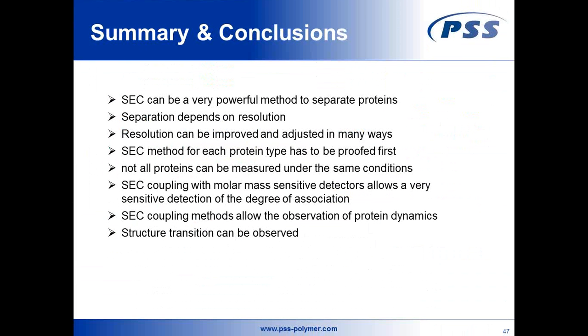So this brings me to the end, and I hope I could show you that SEC is a very powerful method to separate proteins. If you do it properly, you can measure protein aggregations, protein dimers, trimers, and higher-mers. And if you add molar mass sensitive detectors to the proteins, if you couple a light scattering or viscometer detector to the proteins, you even get additional structure information of your proteins that helps you to a deeper understanding of what happens in the dynamic of your protein. For example, if you stress your protein, as indicated in my final results before.